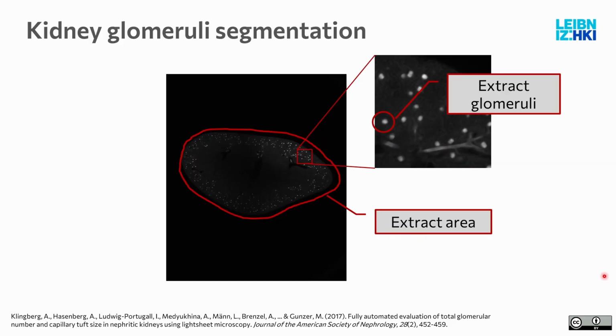So let's switch the data to something that's more interesting. For that, I have chosen this kidney segmentation. This is from lightsheet data, and specifically, we will only handle the 2D slices of this lightsheet data from a study where a new clearing method was developed.